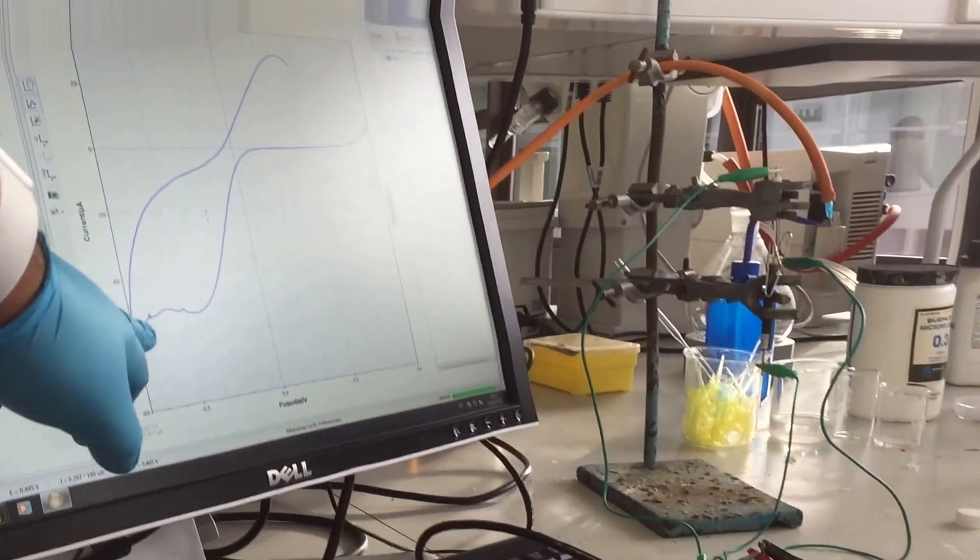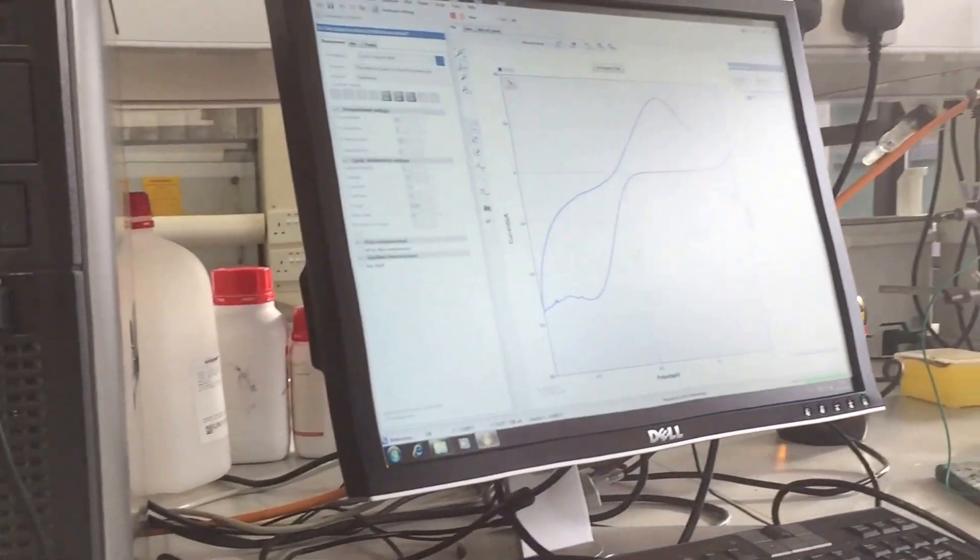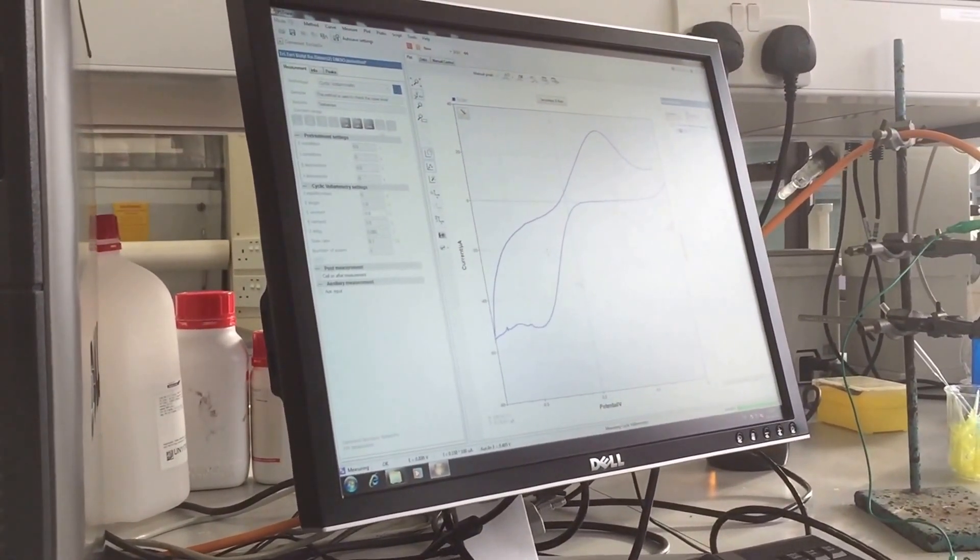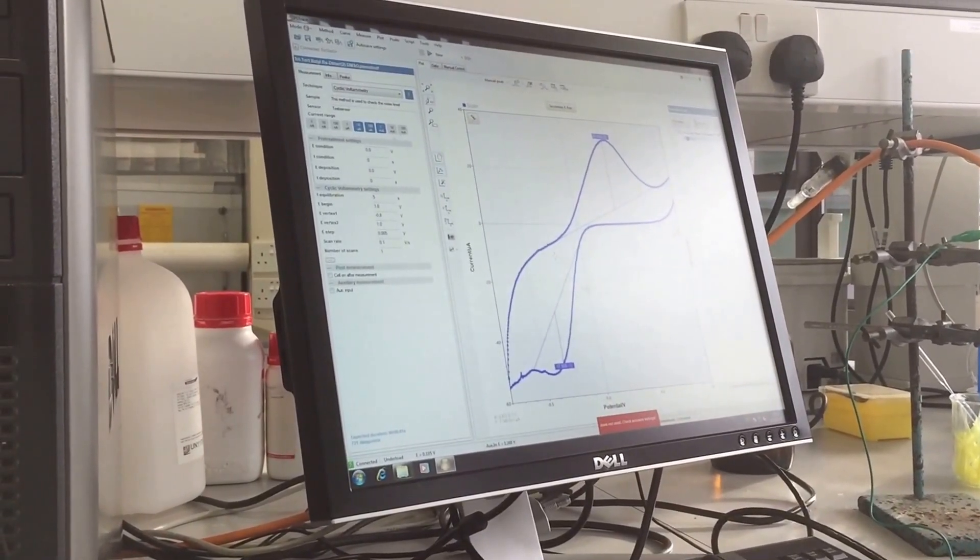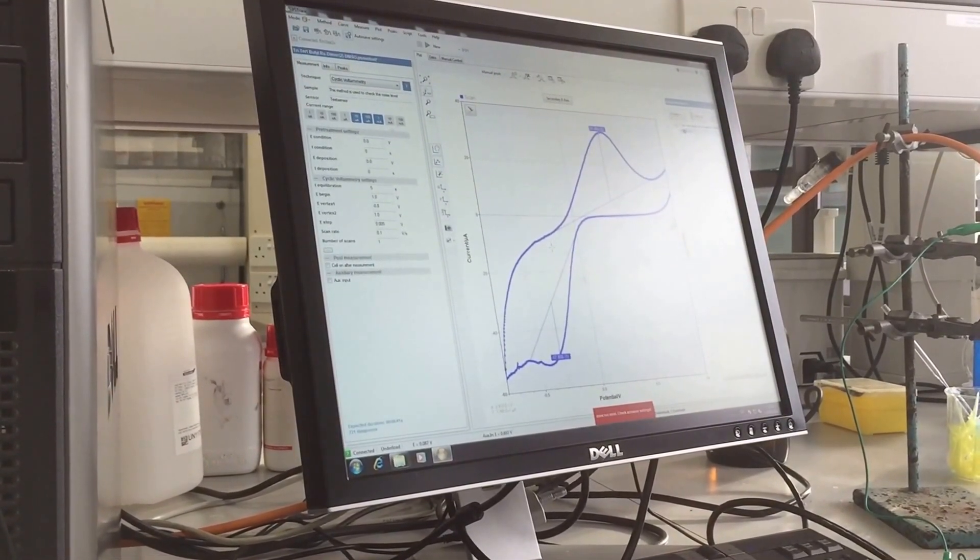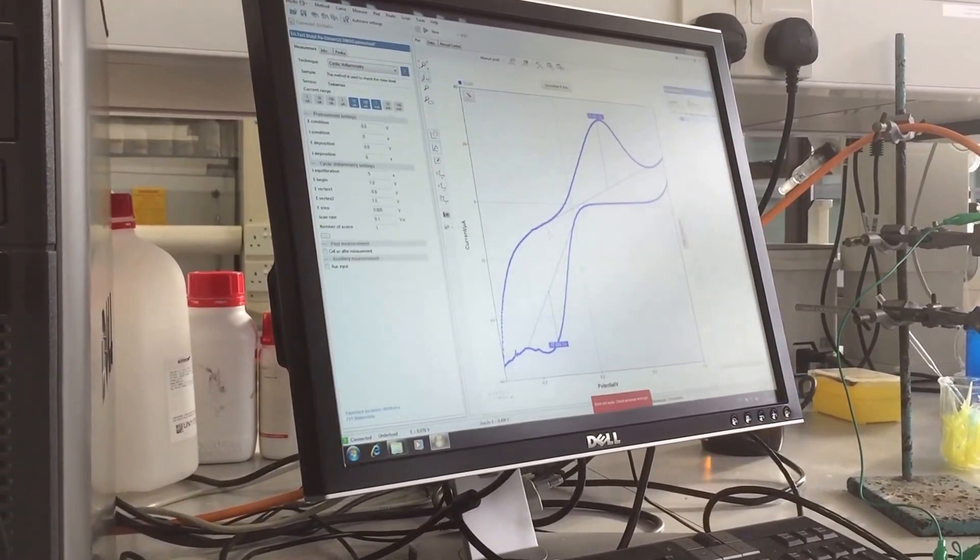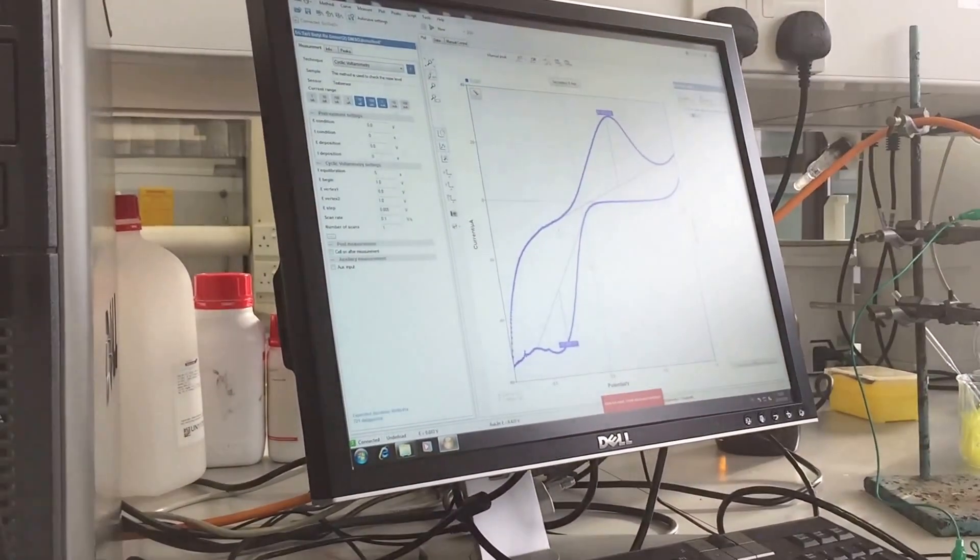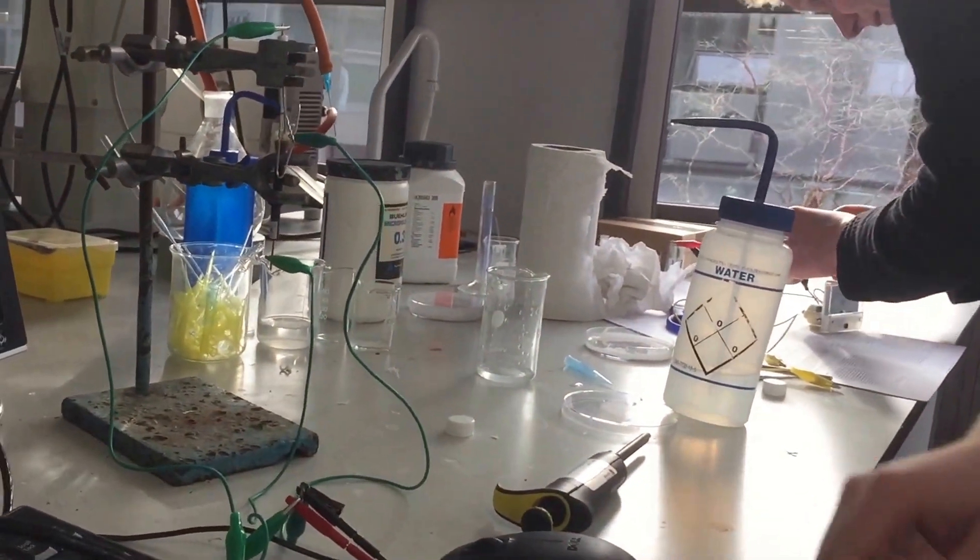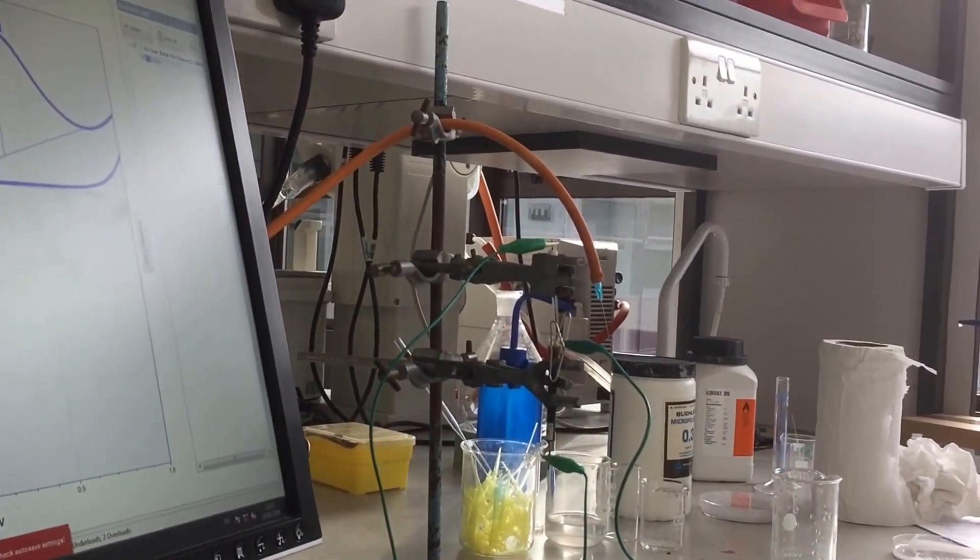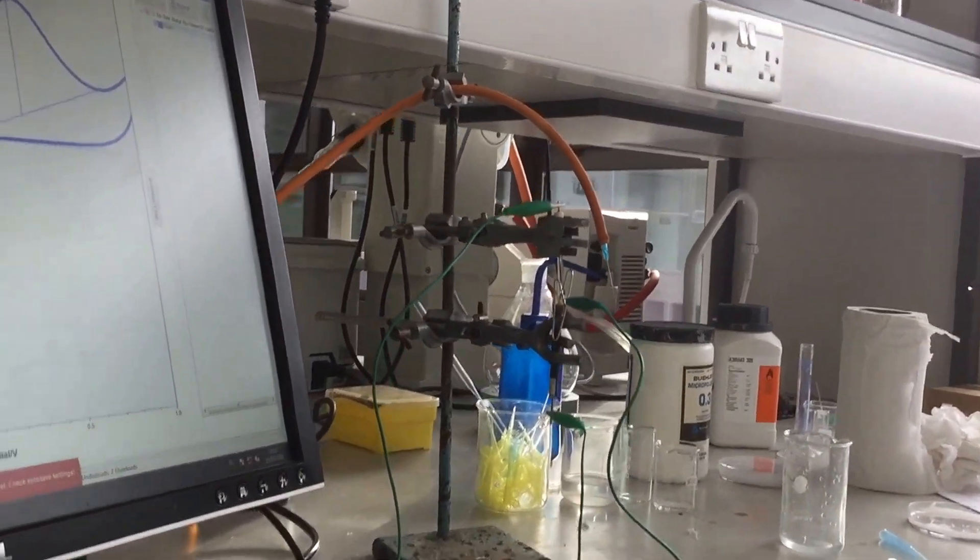What happened here? Is this when you were... That's when I put the nitrogen. Yeah, that looks like it's a... There's something there. It looks like if the nitrogen went through and you're still seeing a reduction peak, it's probably the edge of the copper. So that's not bad. So which one's this? This sample. Yeah. This is testicular estradiol copper. I'll let you type that in. Yeah, I'll type it in.